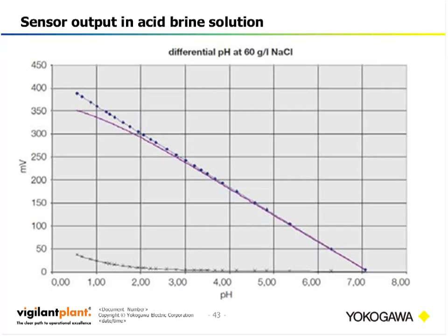The inner solution of the sodium glass is also 1 molar, so the output is 0 millivolts since there's no difference. The line with the dots is the millivolt of the pH versus the common reference, and the line with the X's is the line for the sodium reference. The purple line is the difference between these two values and results in the millivolt output of the combination electrode.